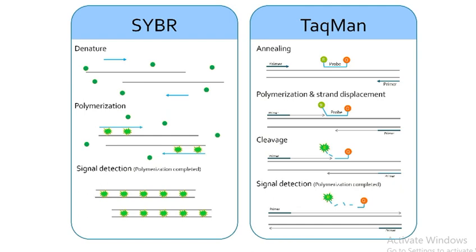Throughout the reaction, we do not know what has happened in the tubes. Once the reaction is done, we run the gel electrophoresis, and at that point we find our DNA was not amplified in the right manner. So a person runs the PCR and then runs the gel electrophoresis.